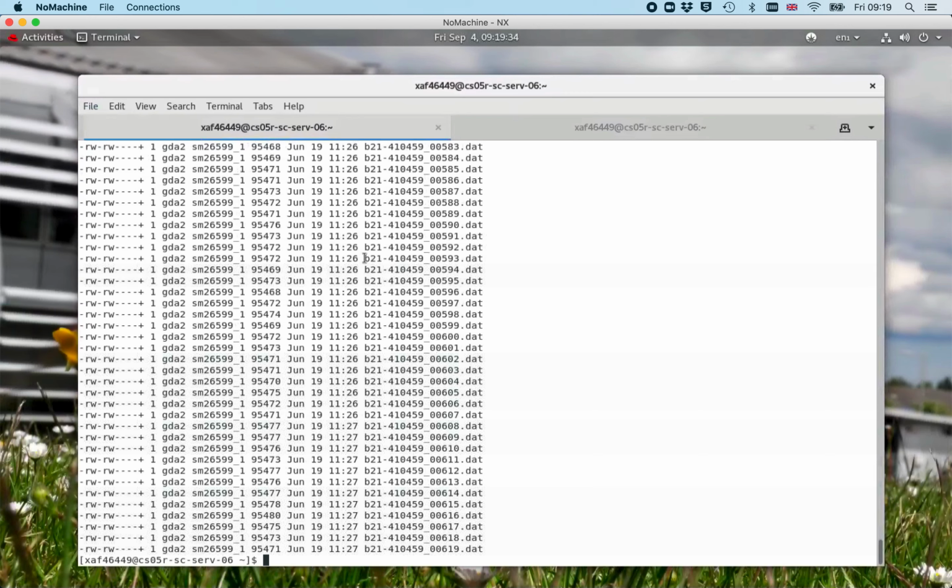You'll notice the images are called with this kind of funny index name. In your top level visit directory, there should be a file called scanlist.csv, and that will contain information about what these files are. They'll have your descriptive title linked to the code name there.